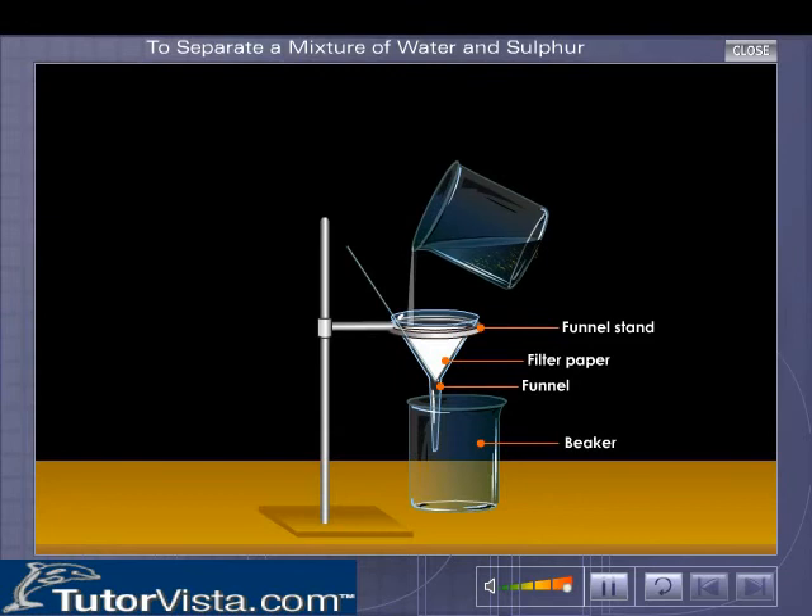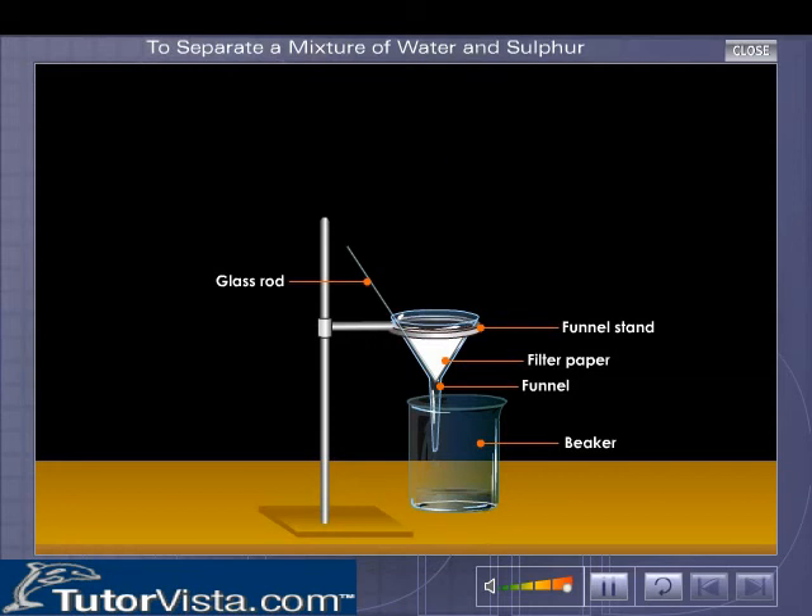Pour the mixture on the filter paper with a glass rod slowly so that the liquid stands below the edge of the cone, as shown here.